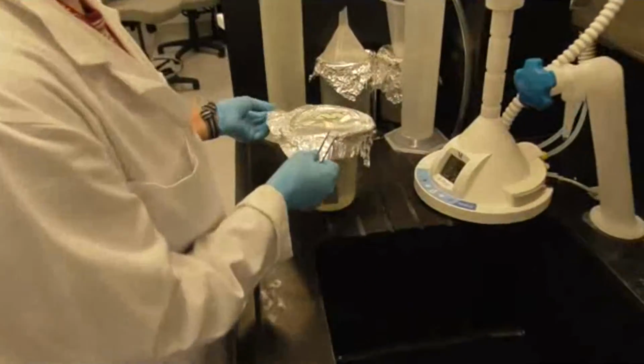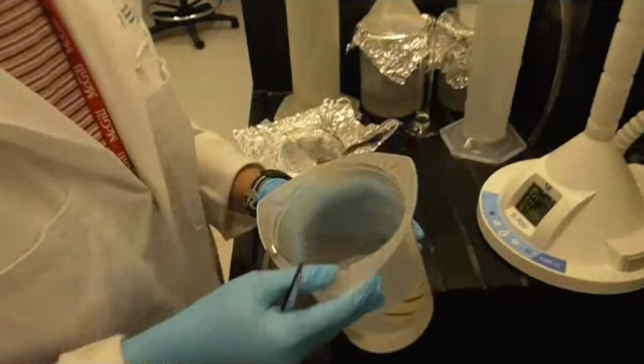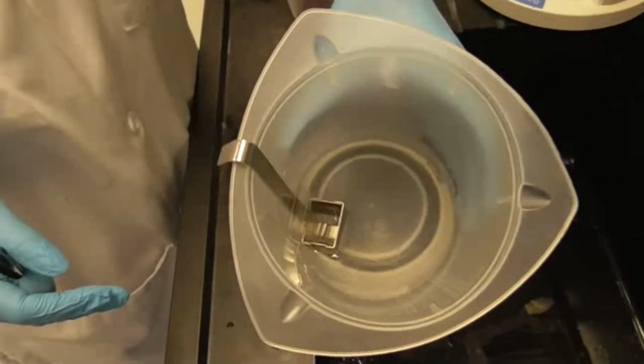Step 1, remove the tinfoil from the container. Step 2, drain out the ethanol from the container, and be careful not to let the devices or cover slips fall out of the container. Watch me here.